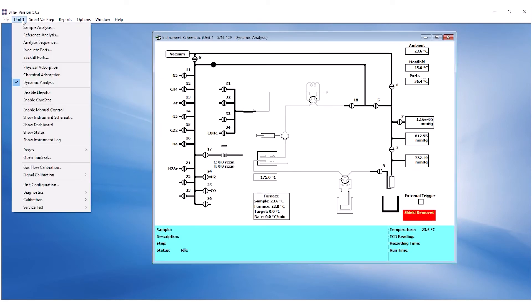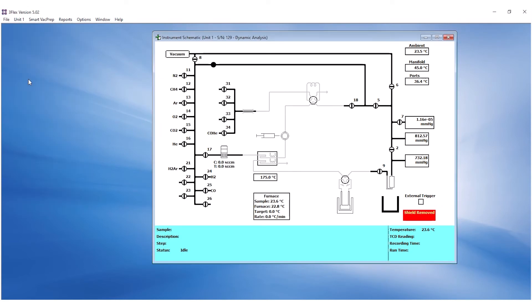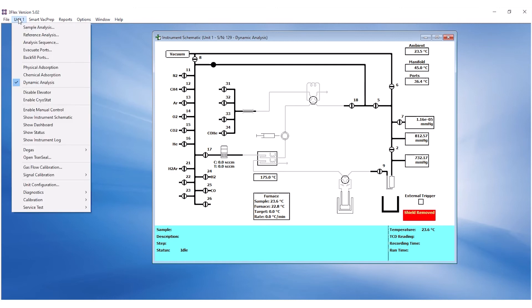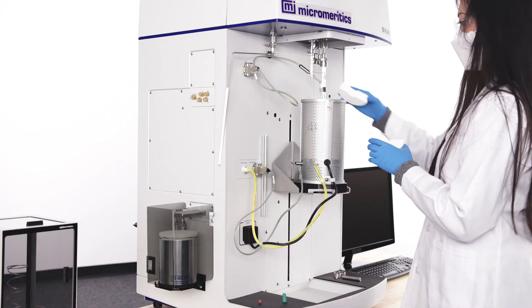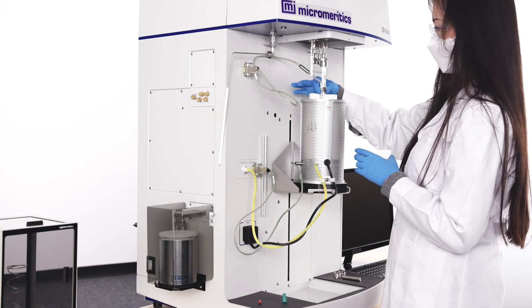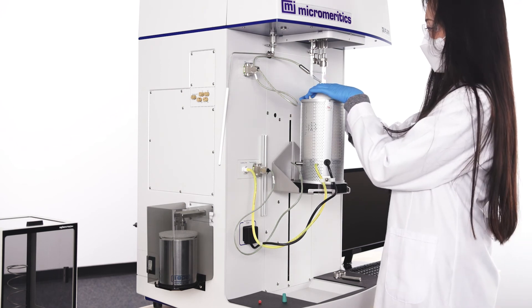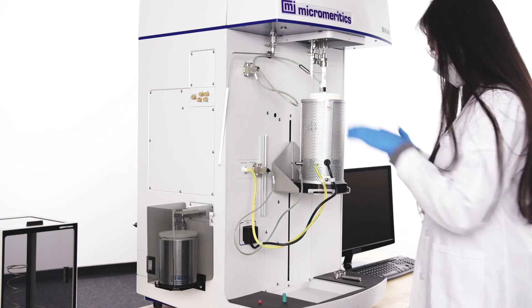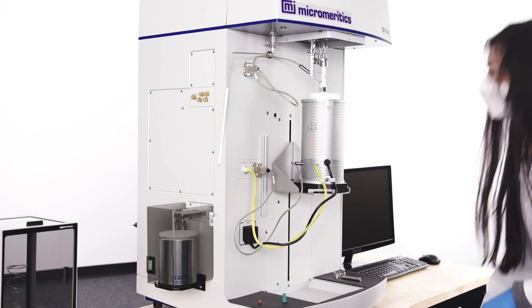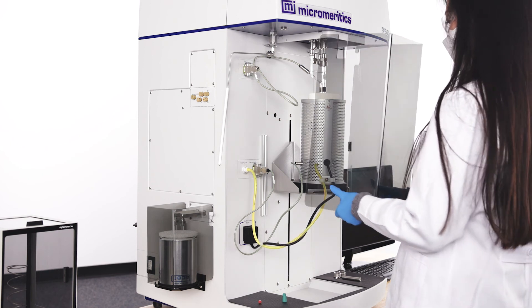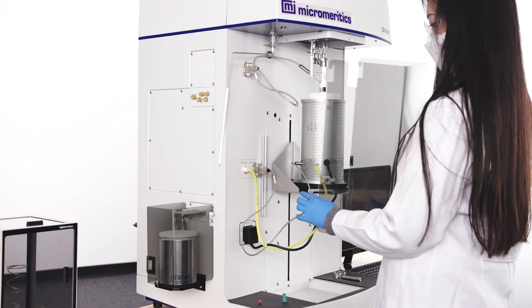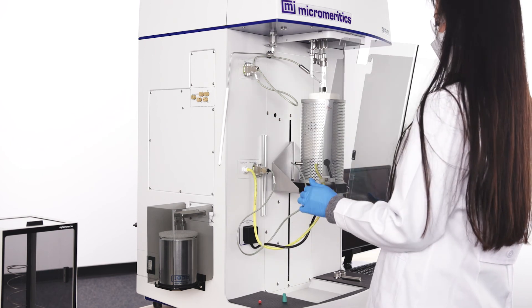To start analysis, click on the Unit menu and select Dynamic Analysis. Click on the Unit menu again to enable manual control. Right-click on the elevator on the schematic and click Raise. Once the elevator is fully raised, double-check that the thermocouple is in position. Install the insulating discs and place the shield.